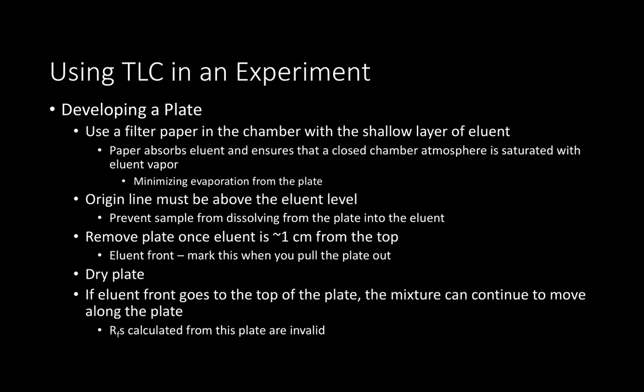It is of note that if your eluent front goes all the way to the top of the plate, or off the plate as you sometimes see it called, the compounds within your mixture can continue to move along the TLC plate. This basically invalidates the RF values that you're calculating off this TLC plate. So if you get busy chatting or aren't paying attention to your TLC plate and your solvent goes all the way the height of the plate, you have to restart and rerun your TLC plate.